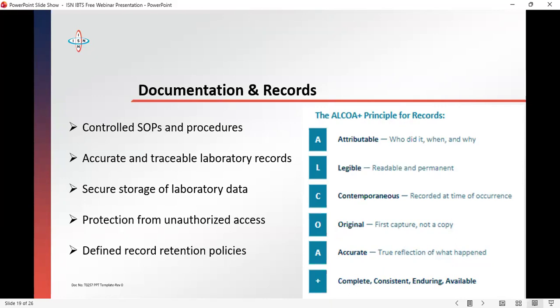Secure storage of laboratory data. Confidentiality is very important. If you use an LIS, do you have software that will prevent hackers from collecting data and using it to try to trick your patients or collect money from them? A lot of people have been held hostage because of results gotten from the lab. If you use an LIS, who owns the data? Who holds it? Are there mitigating risks? Is there data protection on it?